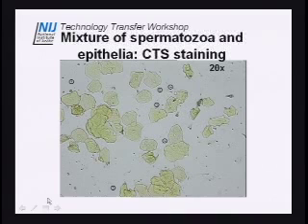Okay, so what I have here on the projector is the mixture of spermatozoa and epithelia. This is what you would typically see using Christmas tree staining, if you took a slide, let's say, out of your sexual assault kit, or you made a slide during a differential. This is using the 20X objective.